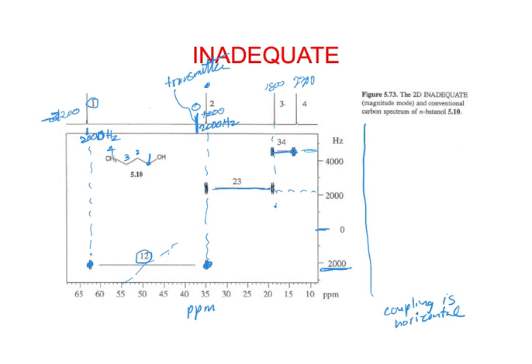Is it informative or not? The offset that they put over there doesn't really matter. It's kind of troubling if you don't understand what the axis means, but we could just ignore it. Yeah, we can ignore it. That's what I've always done until right now.